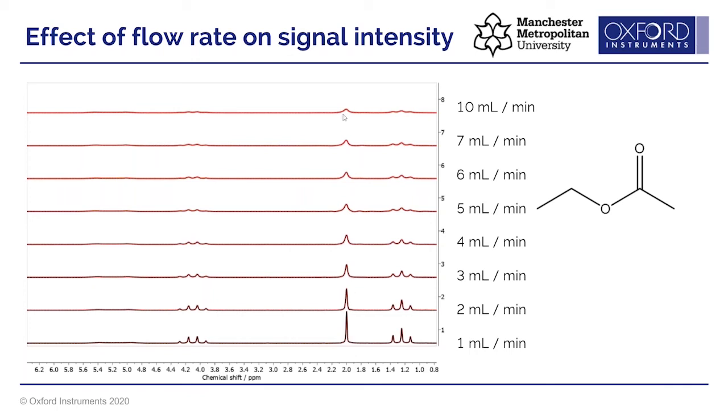Now I've chosen this slide just to show you the spectra as I've actually obtained them. I haven't done any processing on them, and certainly I haven't tried to make certain spectra look bigger than they are. These are all relative to each other, so we can see the effect of the broadening out when we go to the quicker flow rates. But what I wanted to impress upon you is the fact we can still see those signals even at the higher end of the flow rate.